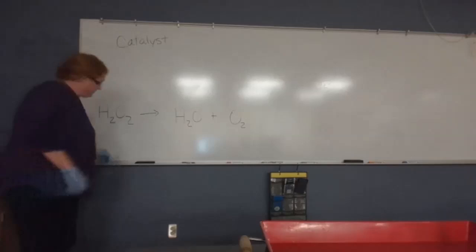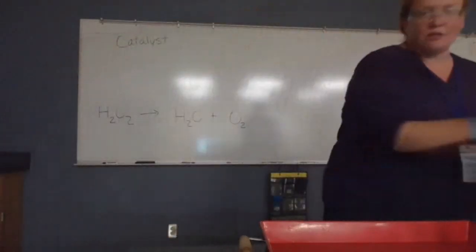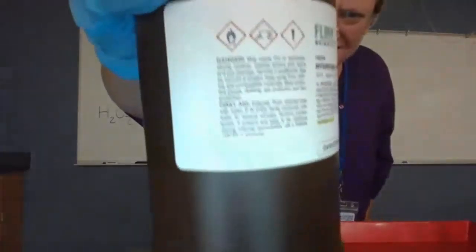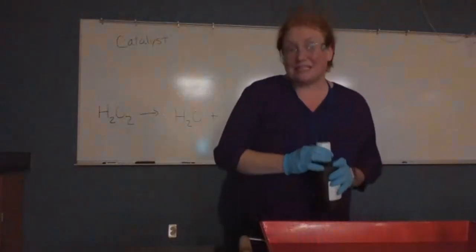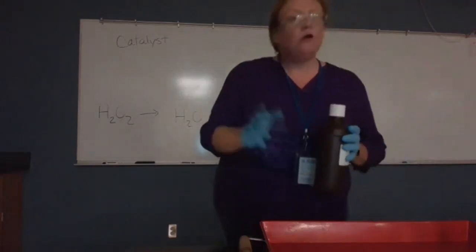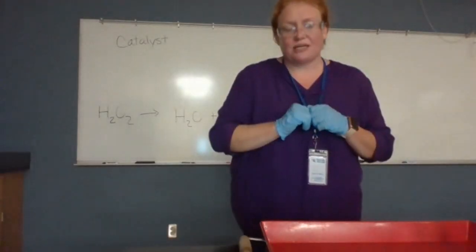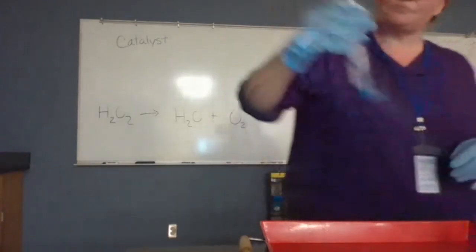This is also known as elephant's toothpaste, but this demonstration I'm doing for you is not using 3% peroxide that you would buy at a store. This is using 30% peroxide, which is like what you would buy to clean a pool. This is very strong, so I'm wearing gloves and things, and you should not do this at home with 30% peroxide. You may do an experiment that's elephant toothpaste using 3% peroxide and a common household substance.